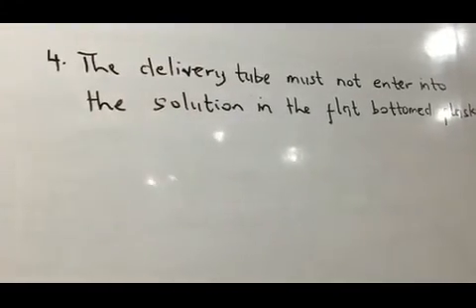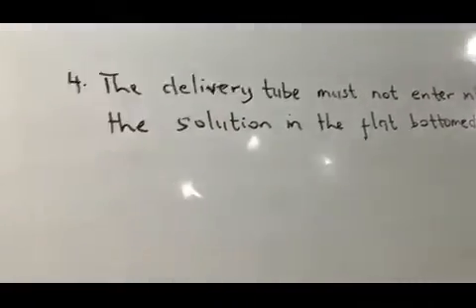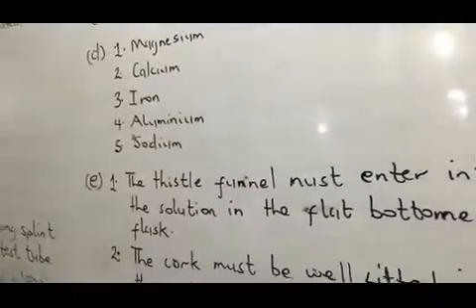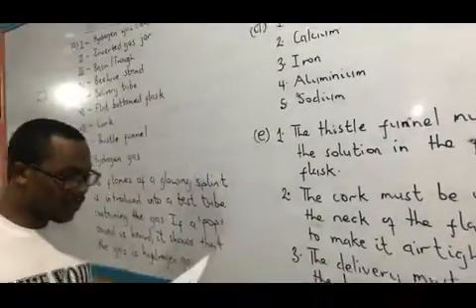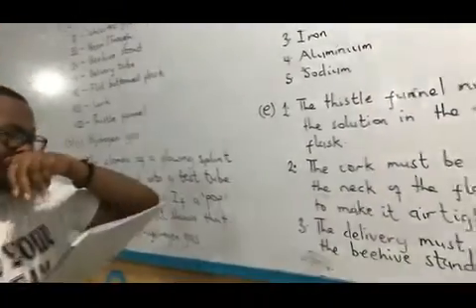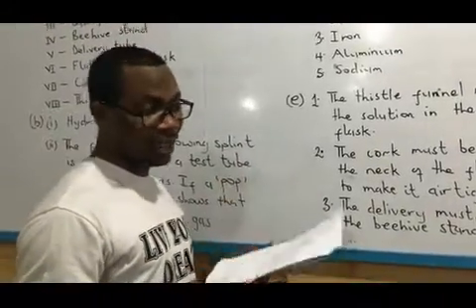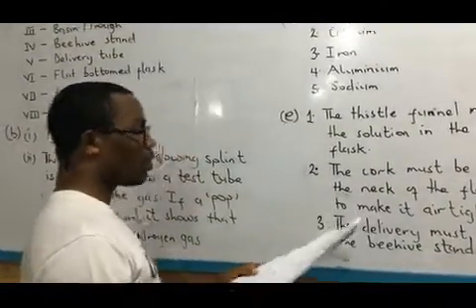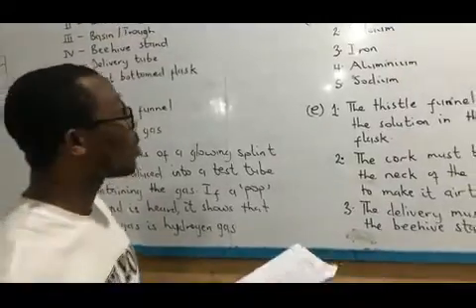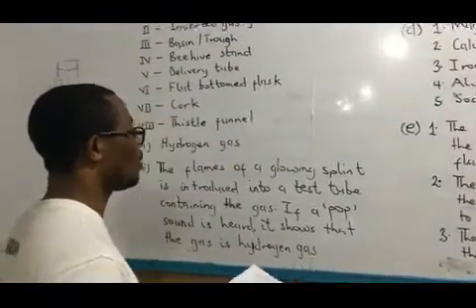Okay, so those are some of the precautions that you need to take. You can even add this there. The flat bottom flask has to be well supported and firmly held in position. Okay, so those are some of the precautions. You were supposed to give 2. I've given you 4.